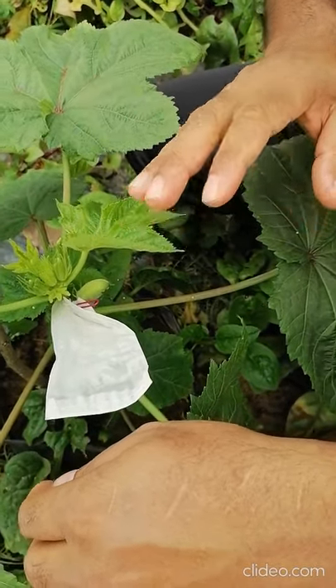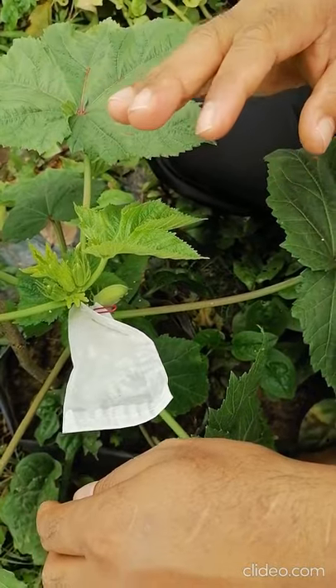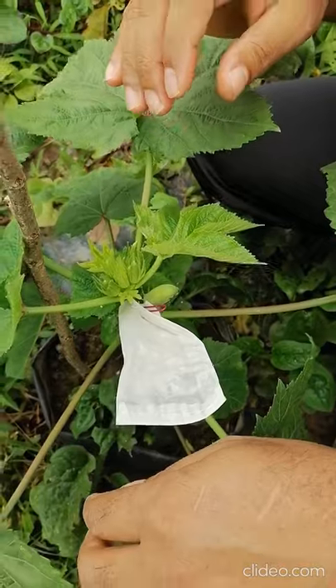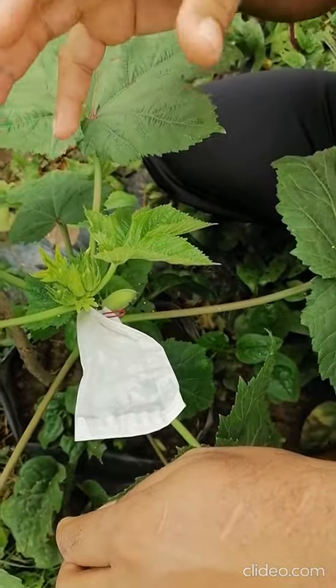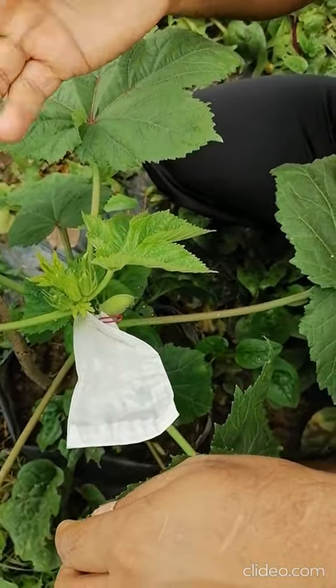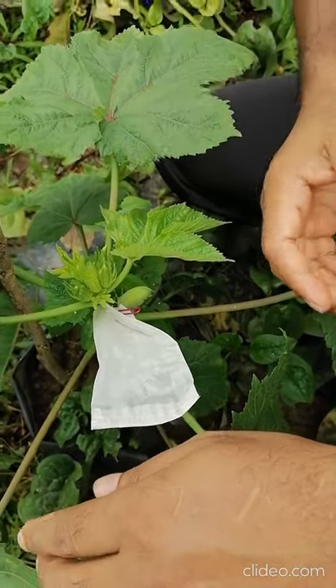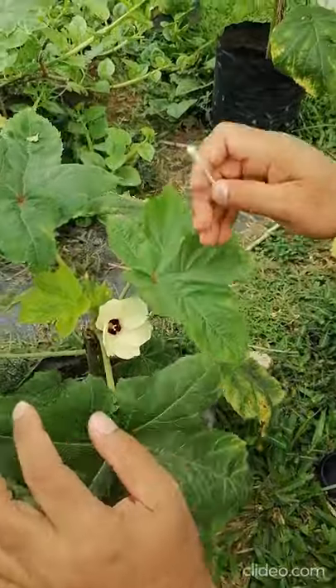This is called the emasculation of okra — removing of anther from the female parent. You are considering this plant as the female parent. Another time you have to collect the pollen from the male parent and do the pollination. I will show how we do this.